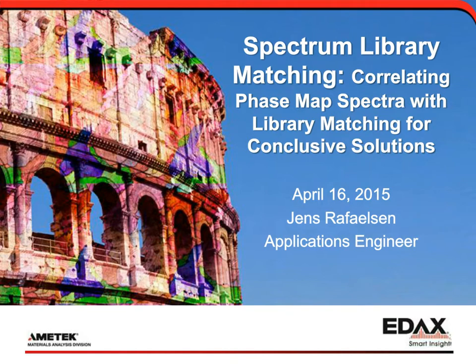We are going to be looking at a few minerals today. So given my background, and given that some of you might have a geology or minerals background, I'd like to apologize beforehand for any mispronunciations. And I know those of you in geology like to use the one with oxides. We're not going to do that today, so that's the way it is. But with that said, let's get started with today's presentation.